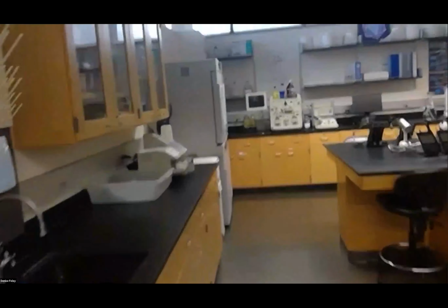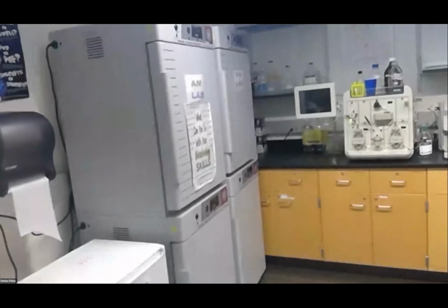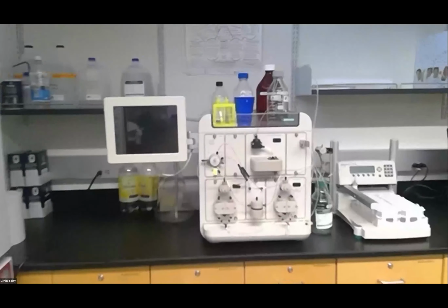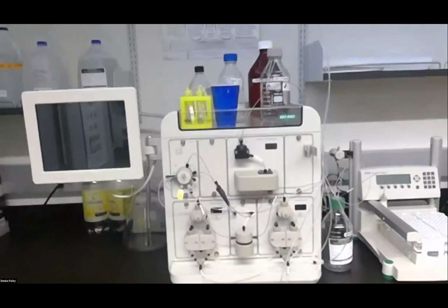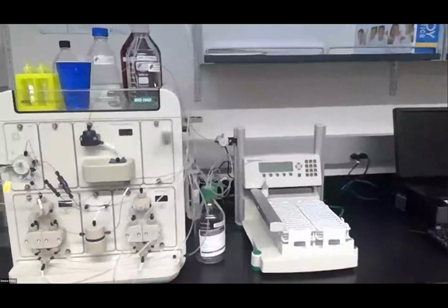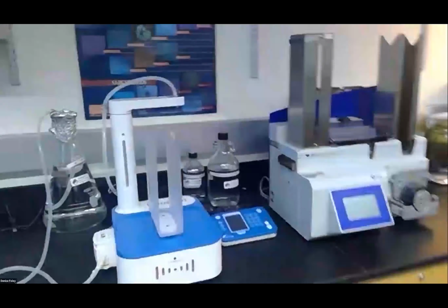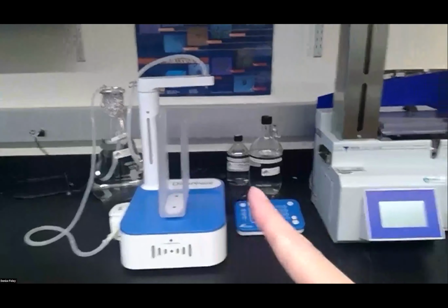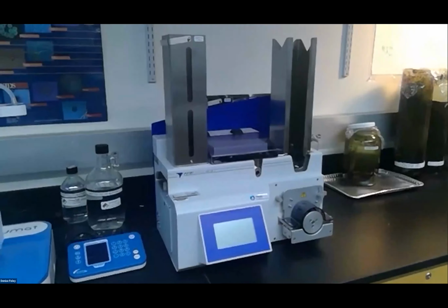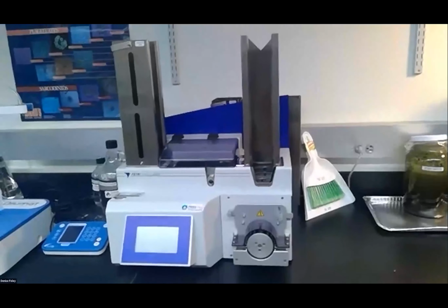I'm just gonna walk a little bit around and show you how the room's set up. So these are some of the incubators that we set at different temperatures in order to do some of our experiments. This piece of equipment right here is a fast performance liquid chromatography. It's a very expensive and advanced piece of equipment that the students that are taking the protein class would learn how to use to purify out proteins. And over here are a couple of our robots that we showed students how to use. There's an automatic diluter right here. And I'll show you this working in a little film during my presentation. It's an automatic plate pourer. So we can make media plates that are very precise and kind of industry grade.